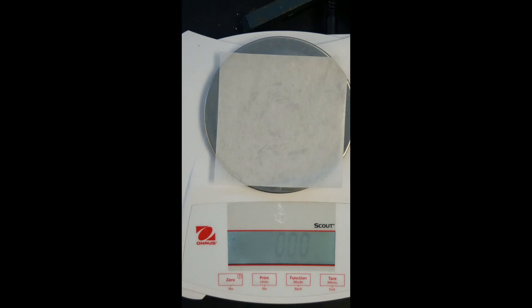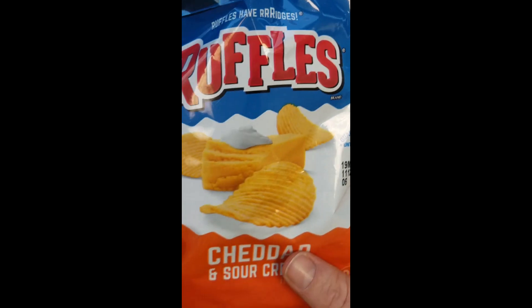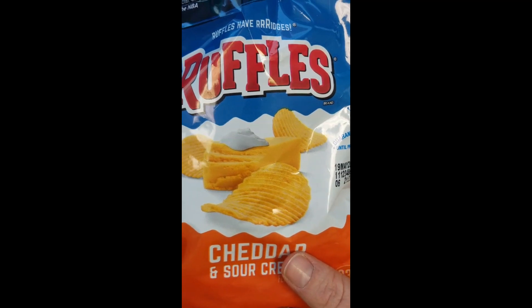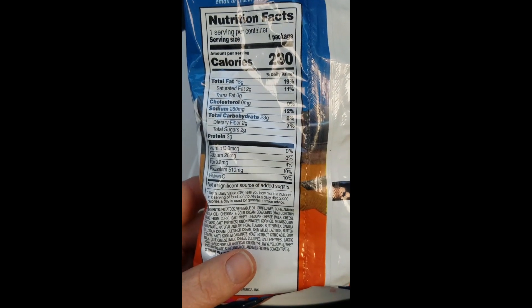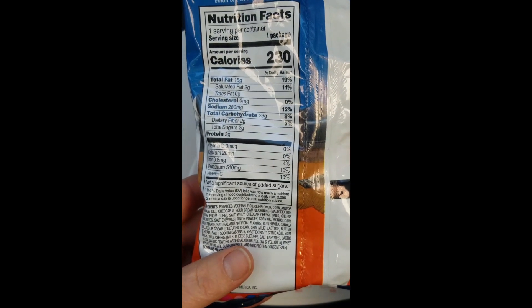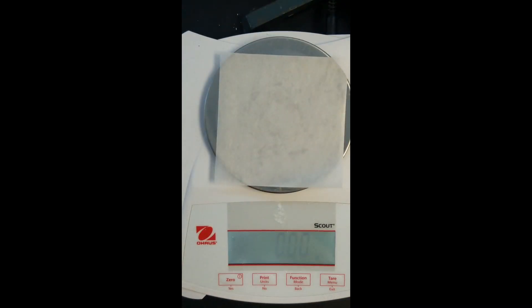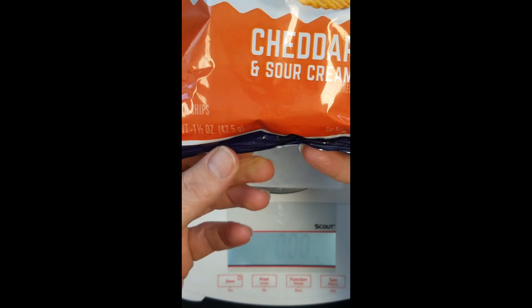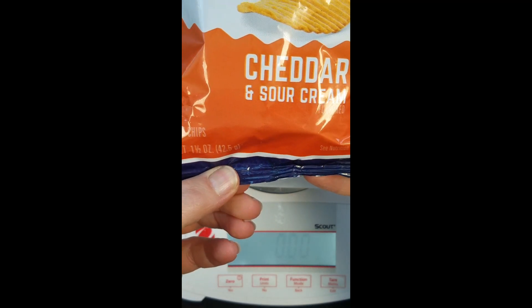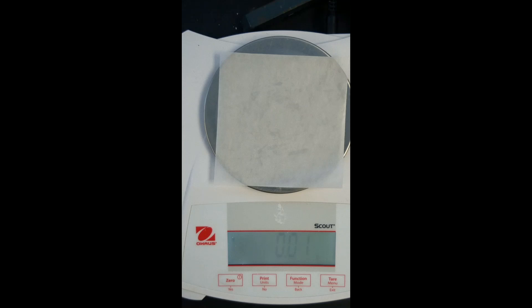We're now going to take about five grams and this mass doesn't have to be exact. We're going to use Ruffles. And so we have our label and this is a 42.5 gram package. We weigh out about five grams of chips.